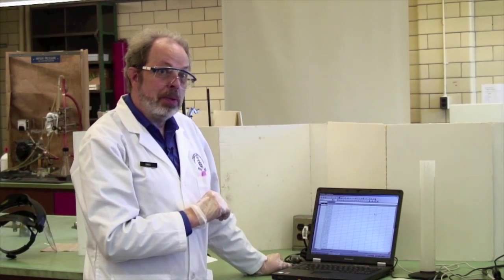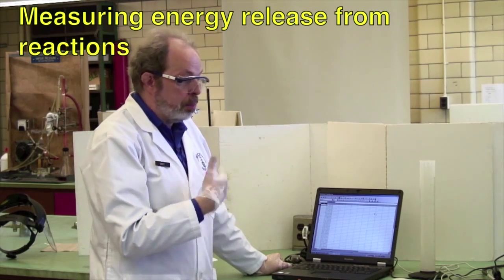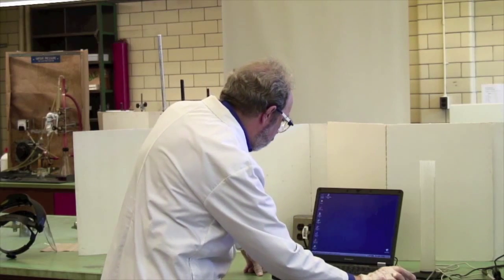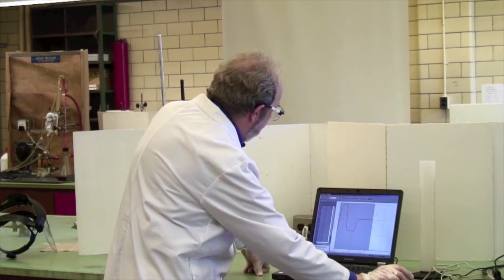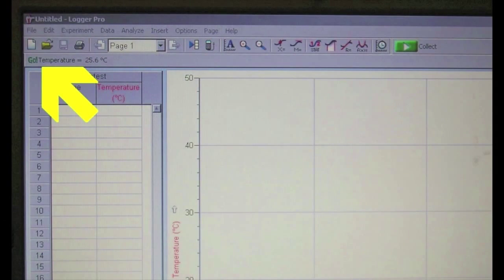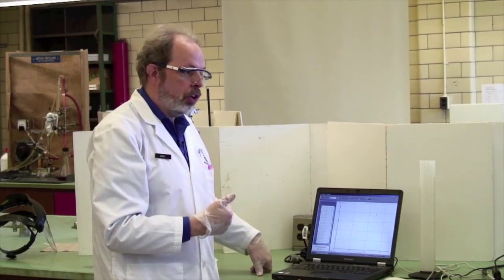It's now time to actually do some chemistry and mix some chemicals that are going to produce heat. To do this, let's go back to LogoPro. And now that I've printed it, I can get a new. I don't want to keep that. And so we're ready now to start with a new run.